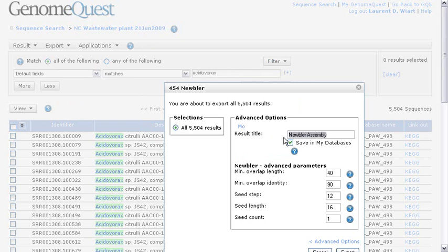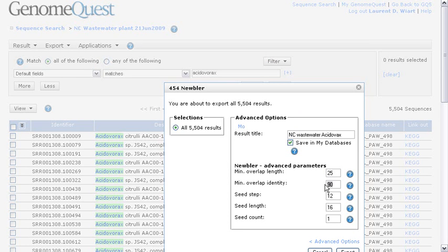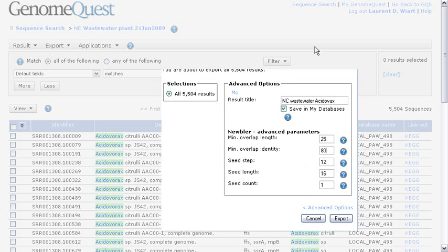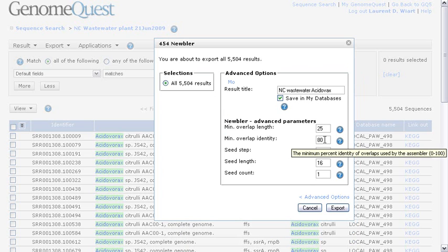On this page, as you can see, I can give a name to the resulting database, which is going to be called NCWastewater ACIDOVORACS. And I could change a few parameters, for example, have a shorter overlap with a lower identity. So here, now I'm asking for an overlap of 25 at least, and at least 80% identity.